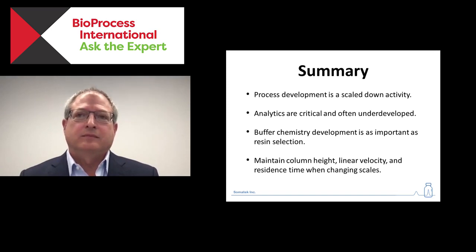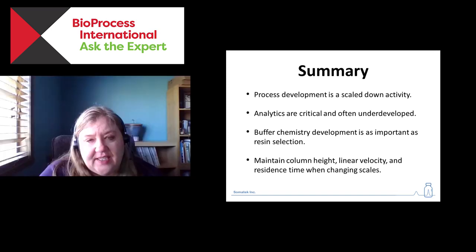Okay. And you're adding nuclease to cell lysate. Do you need to test that you removed all nuclease and/or nuclease activity from the purified product?